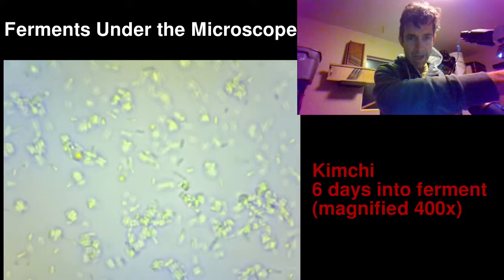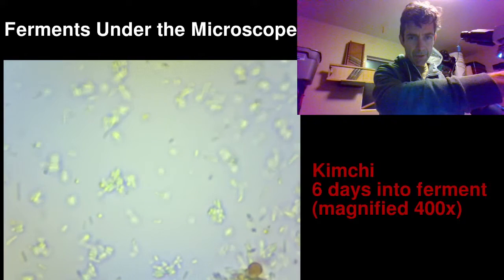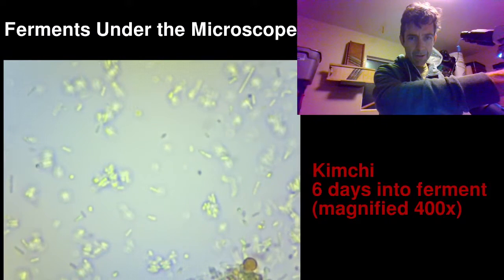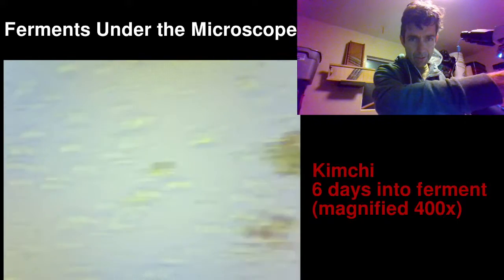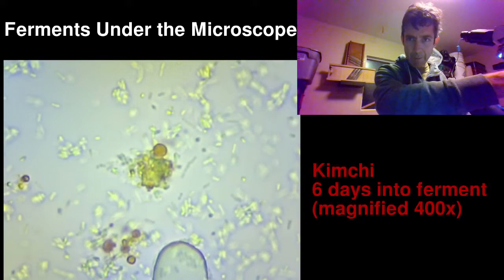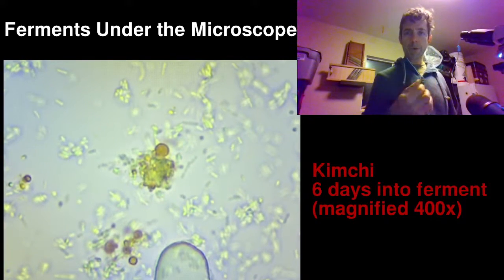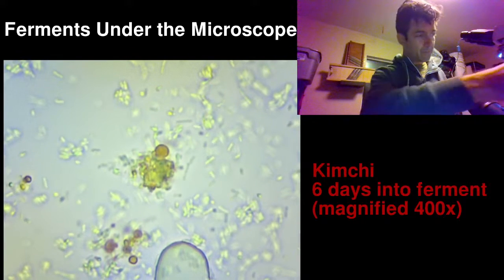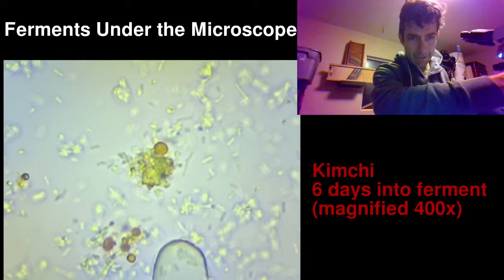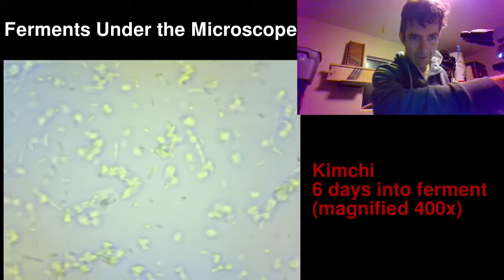The clear background is just the water, the liquid. If we navigate around here we can maybe find a piece of vegetable matter — this is probably a little piece right here in the middle, probably cabbage or radish. The little round red circles are probably oil from the red pepper powder, the gochugaru. It's pretty interesting — again it's just a test to see if we can get this going.